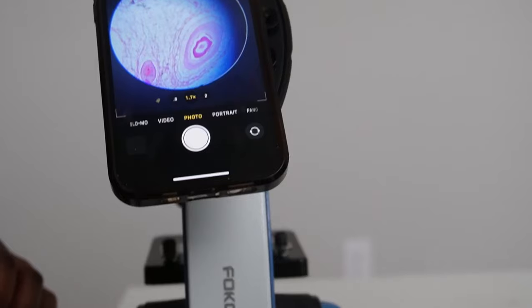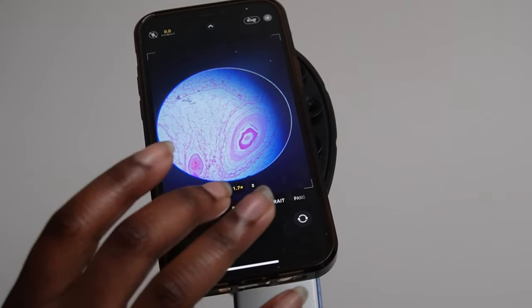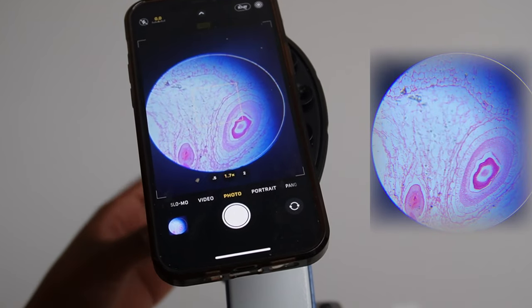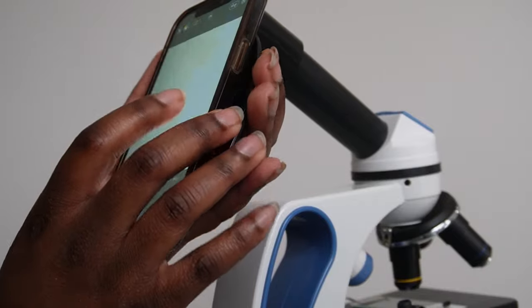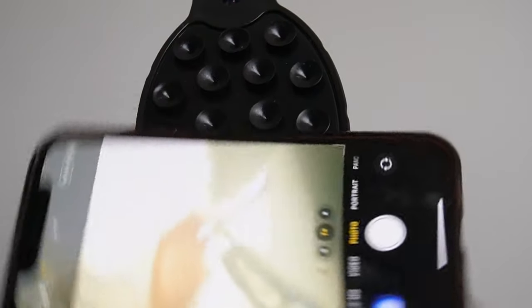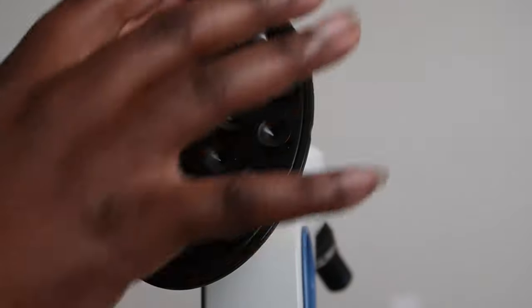Okay, so you can kind of see my phone is focusing, and I'm gonna take a picture just so you can see the quality. But this is on 4x. Don't bump the microscope too hard. Oh my gosh, okay, we're not doing this.